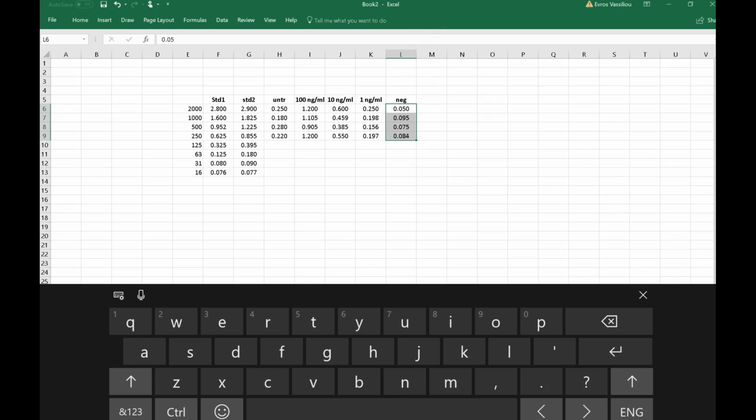And let's remind ourselves, what was the negative for? When you do that experiment, you have a negative. It's basically something that should not have any TNF alpha, right? Should not have any cytokine, whatever you're trying to measure. But let me ask you this. Why doesn't it show us 0? Why does it show color? It's not supposed to have any color, right? Well, the plastic, the reagents you're using, ultimately they give you some color, right? But you want to set that amount of color to 0.